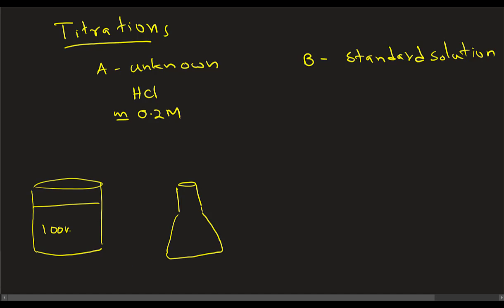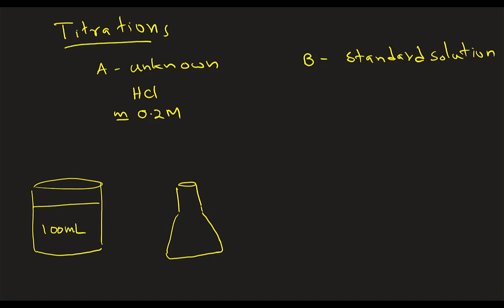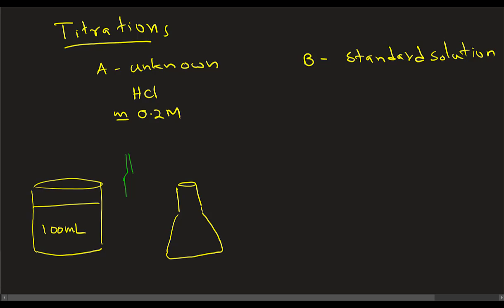So in this case, what do you do? You're given, in a beaker, let's say a 100 milliliter beaker, an unknown solution. What you do is pipette it out using a pipette and the filler bulb that has A, B, C switches. You can squeeze them and deliver exactly 25.00 milliliter precisely into a conical flask. We also call that the Erlenmeyer flask.